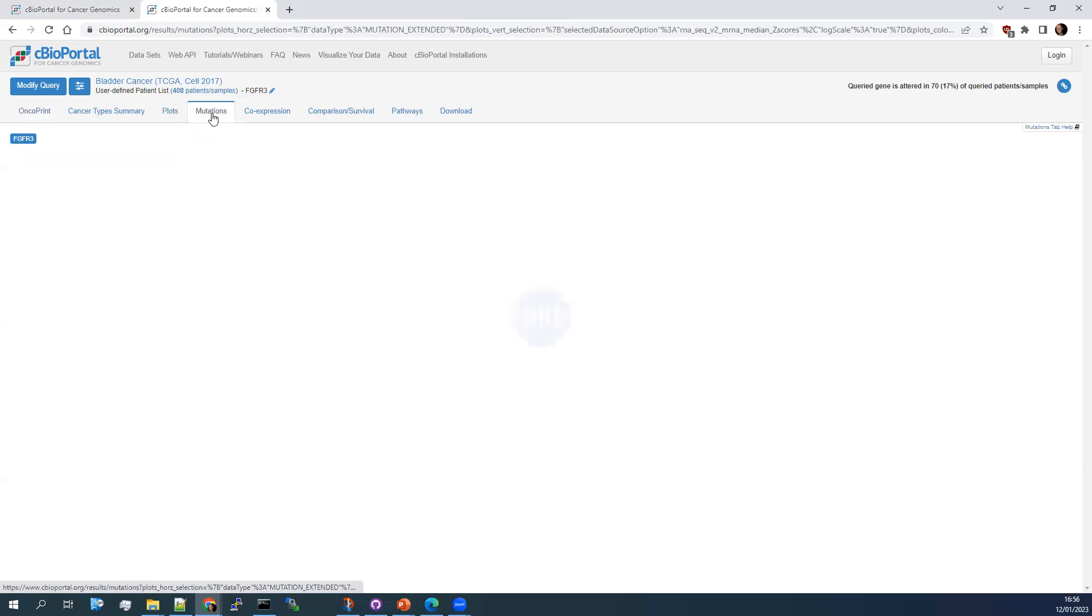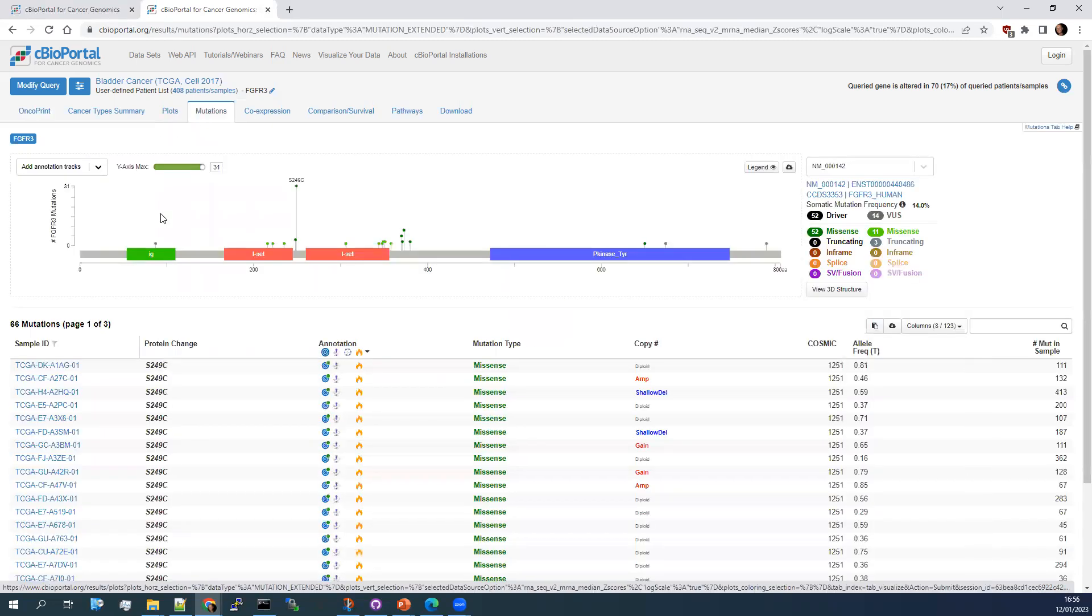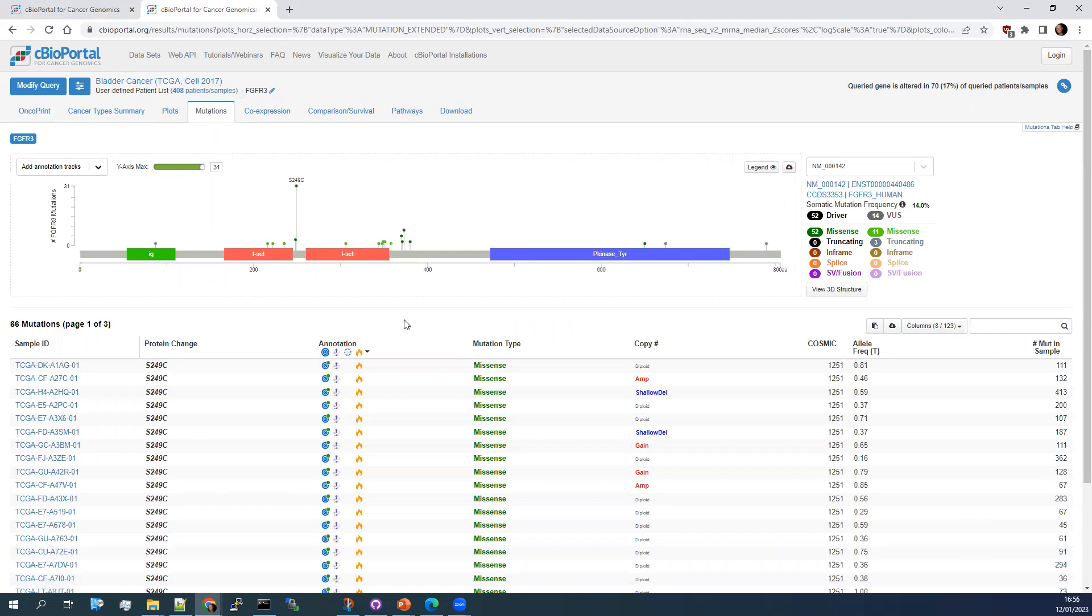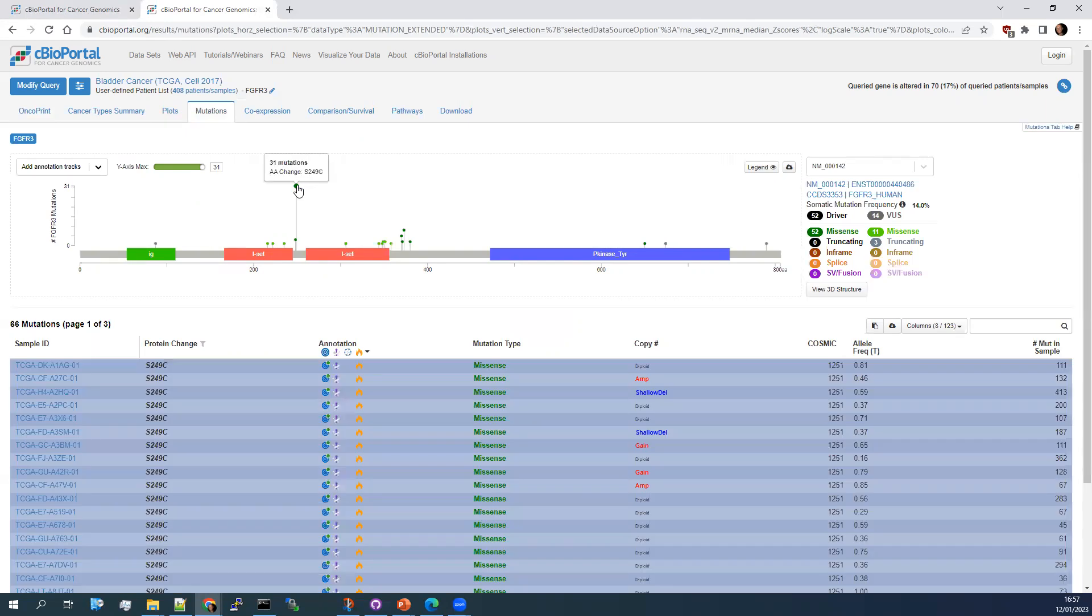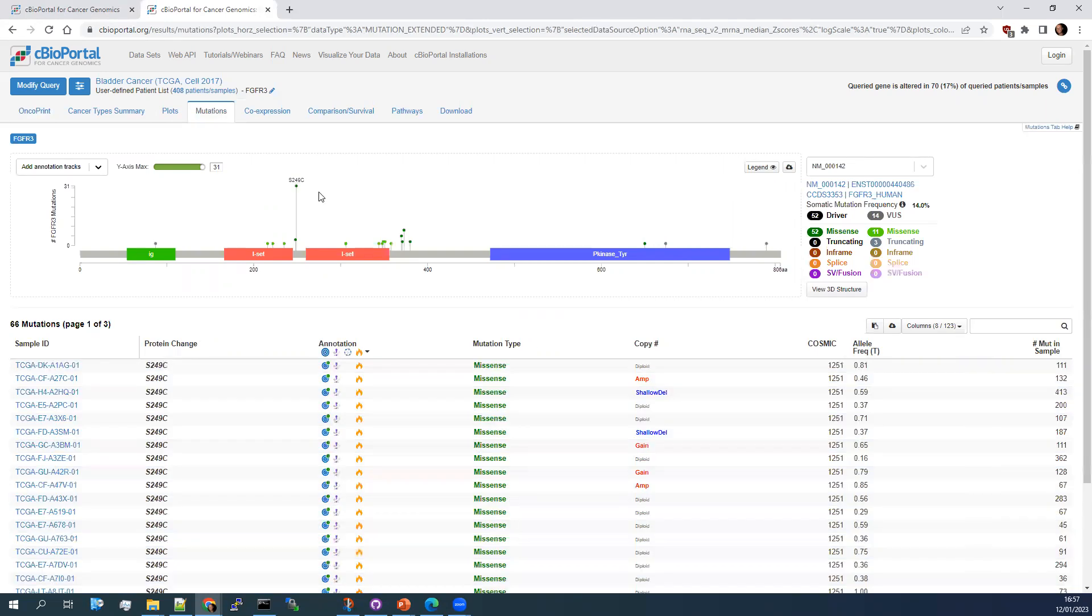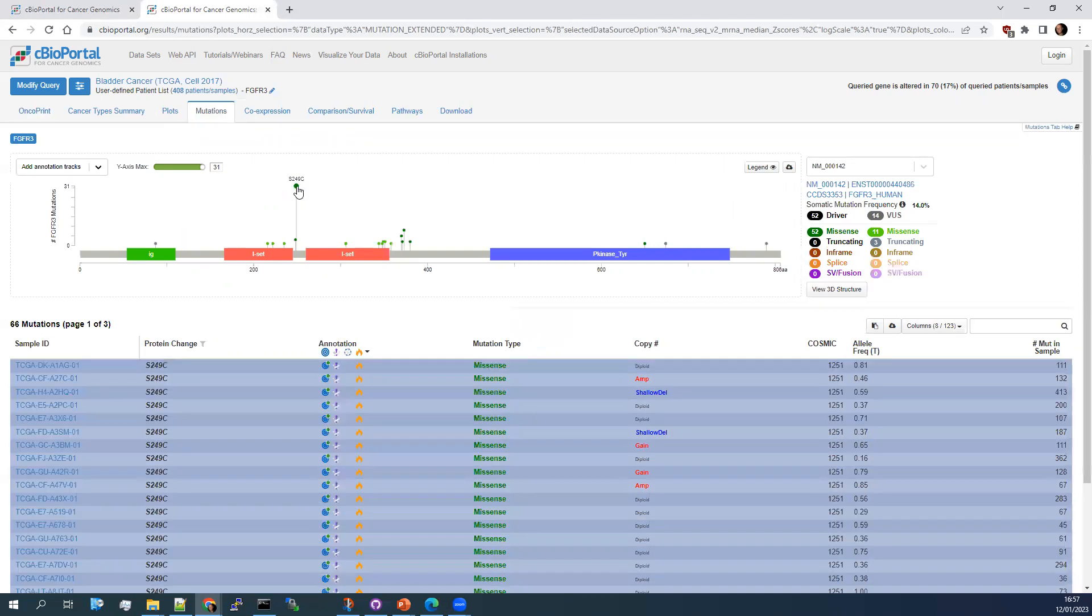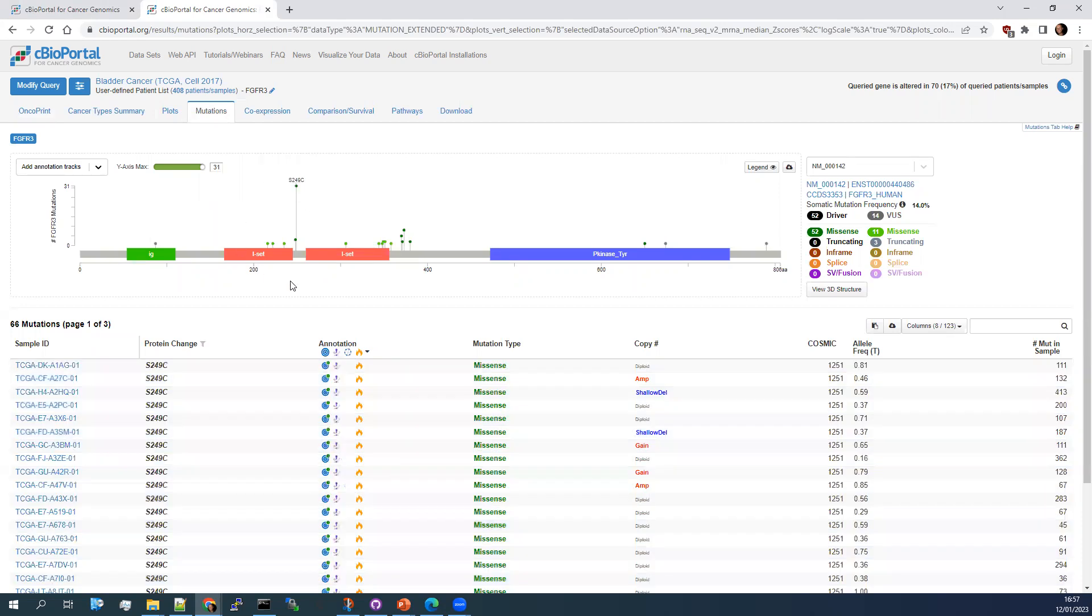A plot that I find really interesting, really useful for understanding the mutations that you have is this lollipop plot. So a lollipop is showing the length of the gene sequence with particularly important domains. The lollipops, so these sticks coming up with a scale on the left hand side, show the number of mutations and in what site. It also means that you can have things like this. So S249C is a hotspot mutation in bladder cancer in FGFR3. You can see that 31 mutations were recorded at this site.